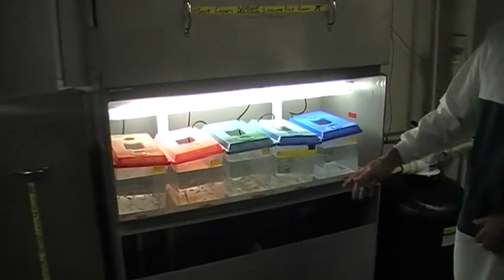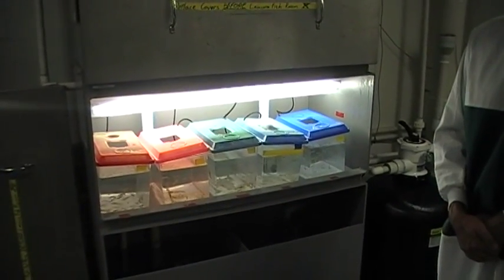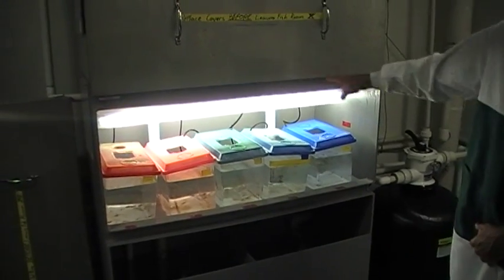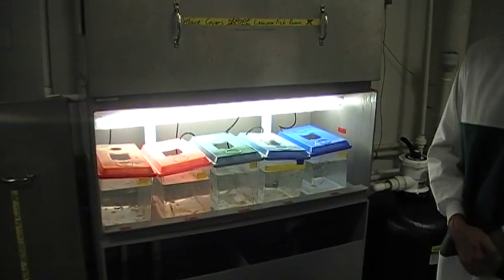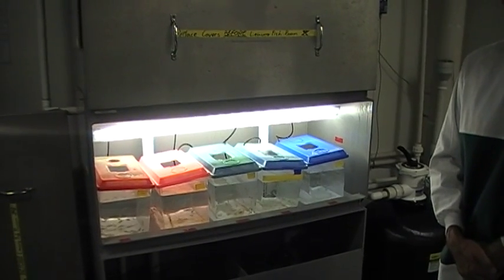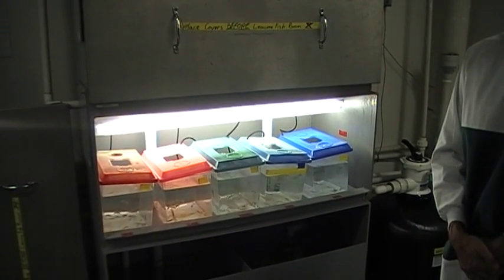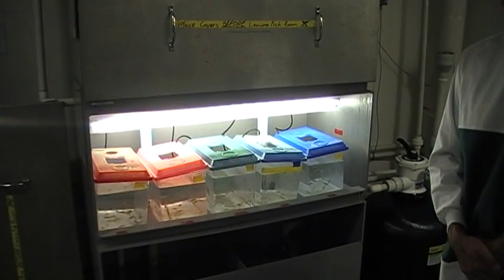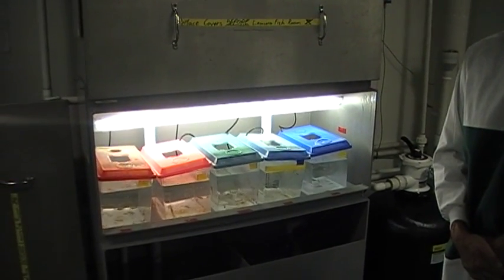Over here you can see a number of zebrafish tanks. These tanks are in a light chamber. The reason we have a light chamber is because the zebrafish like to lay their eggs in the morning when the lights come on, and we want to inject zebrafish eggs all day.